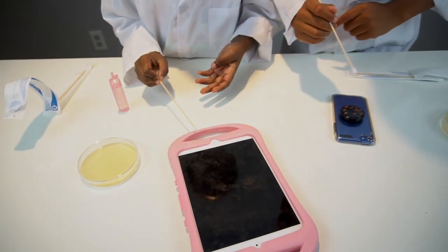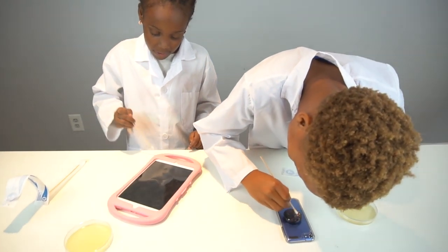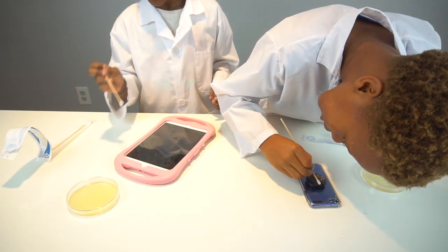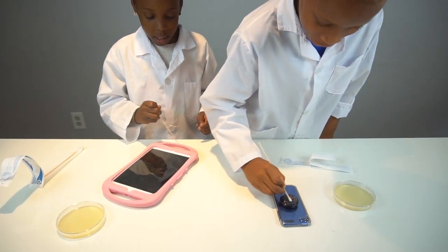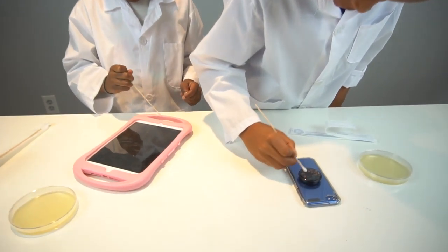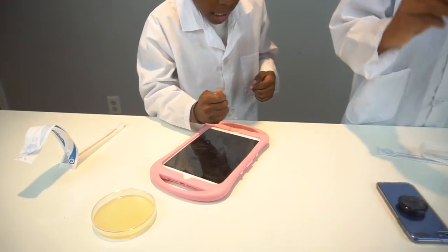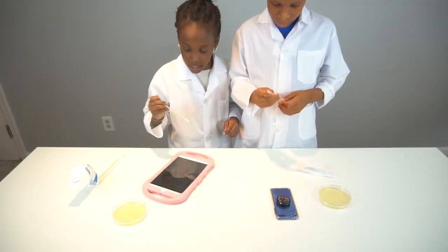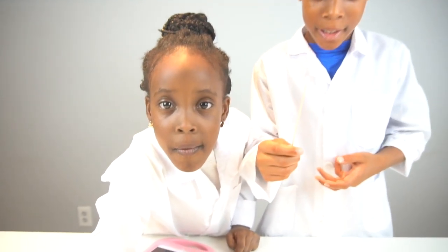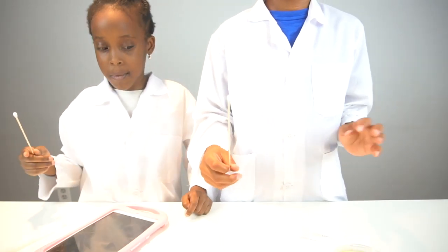The reason why you can't see it is because you think it's clean, but it's really not — that's why you can't see it. As you can see, the cotton tip looks very clean, but when we grow the bacteria in here, it's going to look so dirty.